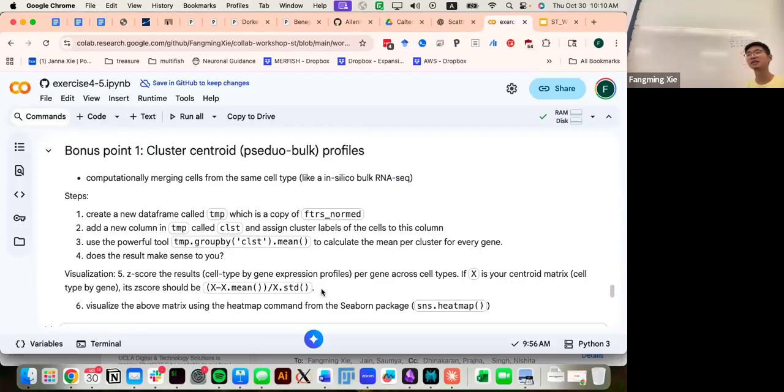I'll give you 10 minutes to try that and see where you can go from there. That's the last exercise of the class. How can you break apart this task once you have a goal? How do you break it apart step by step to get what you need?